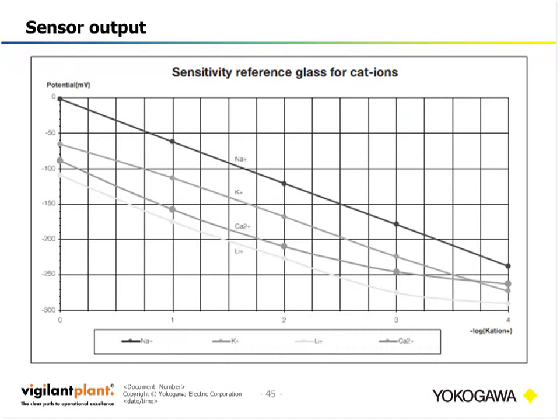The most important thing to understand is that the sodium reference works well in salt solutions, because as long as the salt concentration is constant, the millivolt output of the reference cell is constant. This graph shows different salt solutions with different reference potentials, and a process sample calibration is always needed.